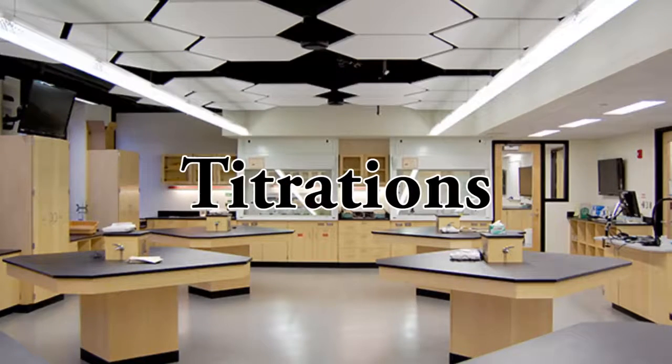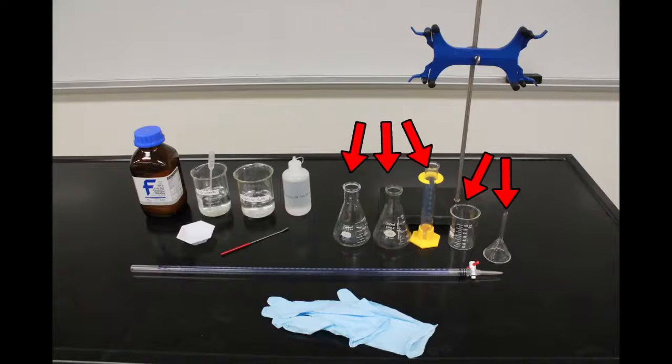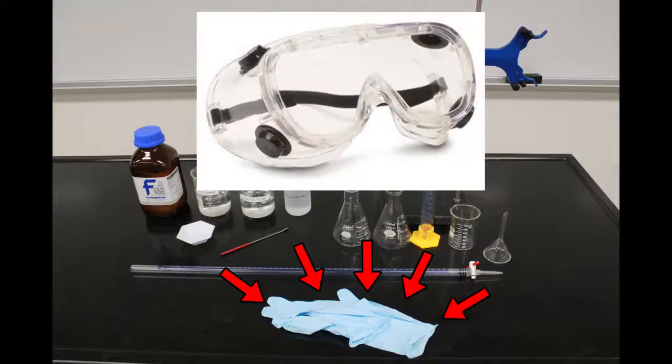Let's get started. Here's what you're going to need: a bottle of KHP, a weigh boat for the KHP powder, a spatula, some deionized water, make sure not to use tap water, your unknown concentration of NaOH, phenolphthalein, I think you're already familiar with this indicator by now, a burette and a burette stand, and some various glassware to measure with, dissolve your KHP in, and collect waste. And of course, anytime you are working with chemicals, you need to be wearing gloves and your safety goggles.